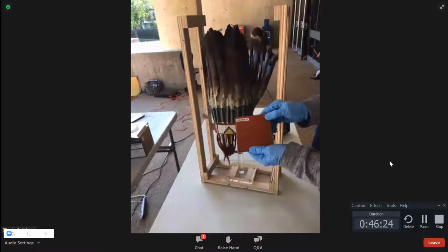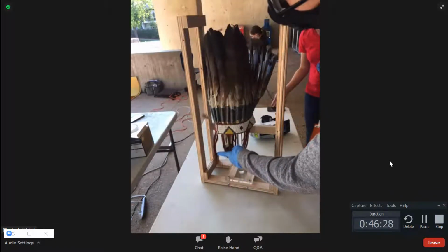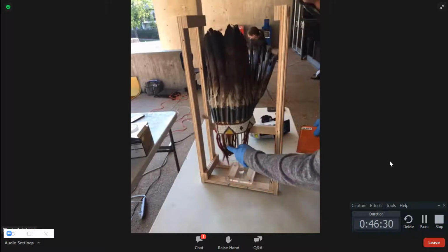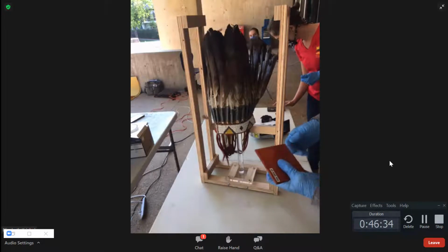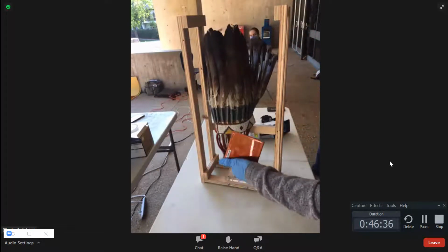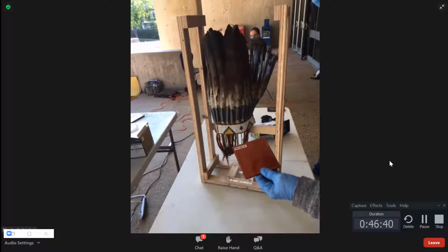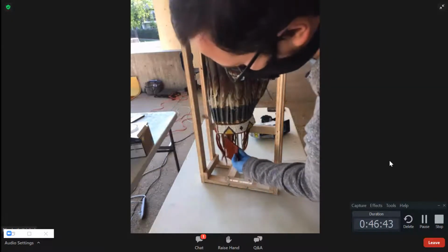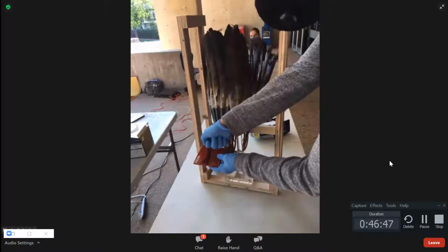Great. So what we're going to do, we want to measure what we think are horsehair tassels right here. The problem is this is not really safe to measure in any circumstance with the XRF. What we can do is use this background plate here. This can absorb the extra radiation that's going to go through the other side, and it's doable here. So what you'll want to do, and Andy, let me know if this is okay. Can she measure down on them like this?